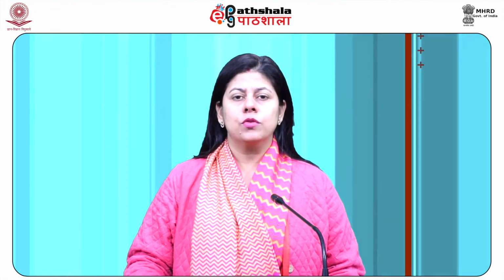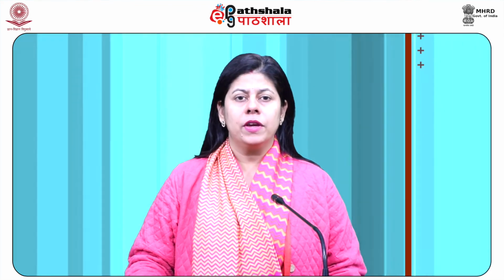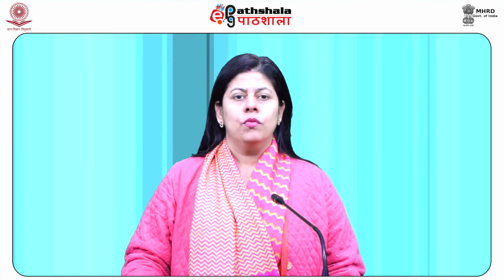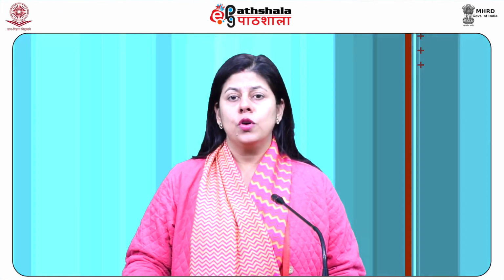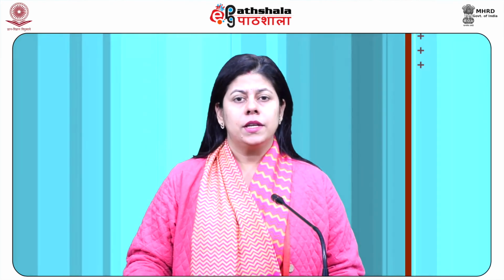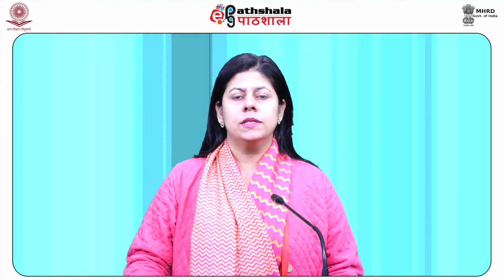A simple microscope is a microscope that utilizes one lens for magnification and is the basic framework of the light microscope. Van Leeuwenhoek microscopes comprise a small, single converging lens attached to a brass plate with a screw apparatus to support the sample or specimen to be examined.